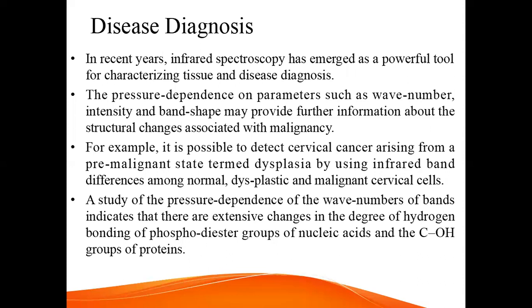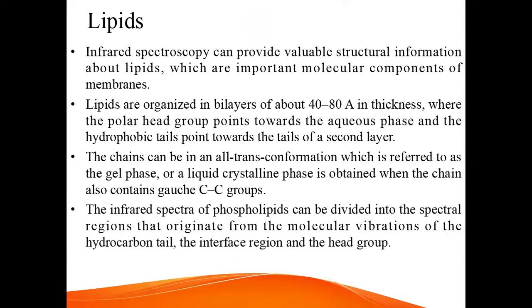A study of the pressure dependence of the wave number of bands indicates that there are extensive changes in the degree of hydrogen bonding of phosphodiester groups of the nucleic acid and the carbon hydroxyl groups of the proteins. Lipids. Infrared spectroscopy can provide valuable structural information about lipids, which are important molecular components of membranes.